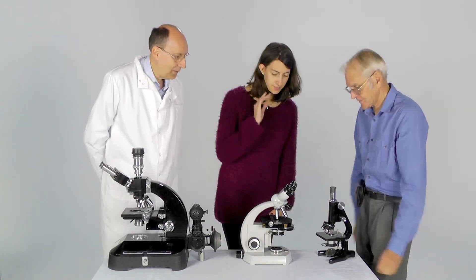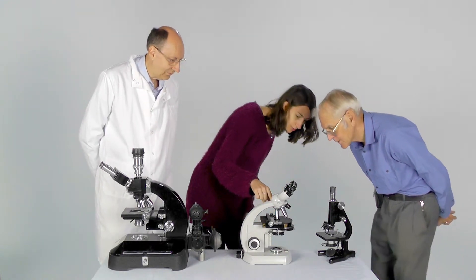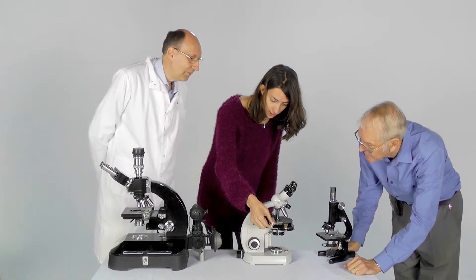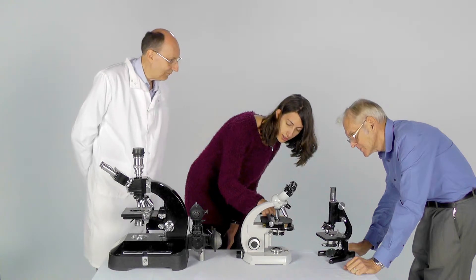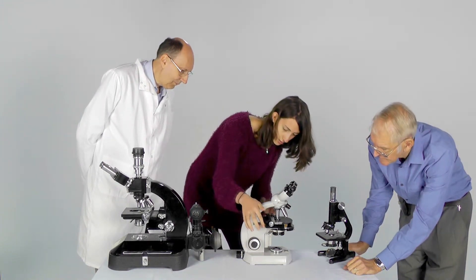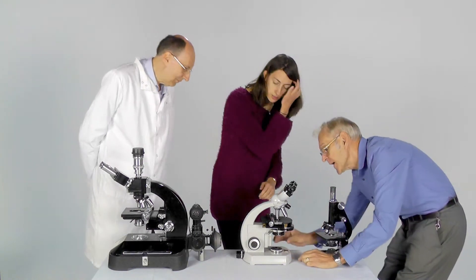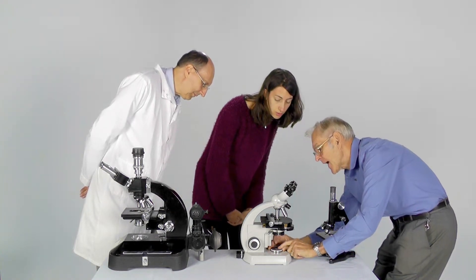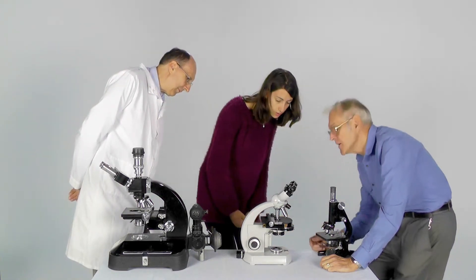Can you walk your way through that and see whether you can identify them? So we've got the eyepieces at the top. Then you go down to the objectives — three or four of them here. You've then got the stage, and you can move the specimen with these knobs — they go two different directions. You've then got the condenser underneath, and you've got where the light source comes from at the bottom, at the base. These knobs are for focusing, moving the stage up and down for the specimen. And there's perhaps one more thing I ought to mention — here we have what's called an iris diaphragm. By turning around this node arrangement, we can make the gap there larger or smaller, and there's a similar diaphragm with the condenser.